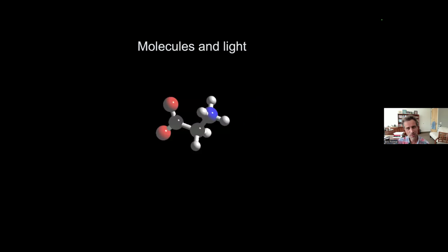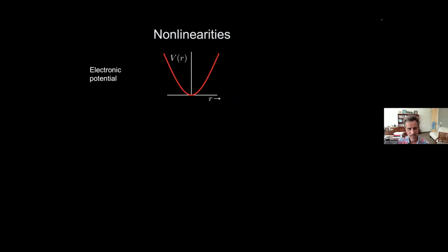All right, so then what I'm going to do is dive in a little bit into what happens if we are driving these molecules in a microscope. Why would they respond in the first place? Or what exactly is this nonlinear optical response? How can we understand that? One way to do that is to visualize this molecule as just a bunch of electrons that are confined on a molecule that start to move when the electric field of light comes in and starts to drive them. So you get basically an oscillatory motion of your electrons that move within the molecule.